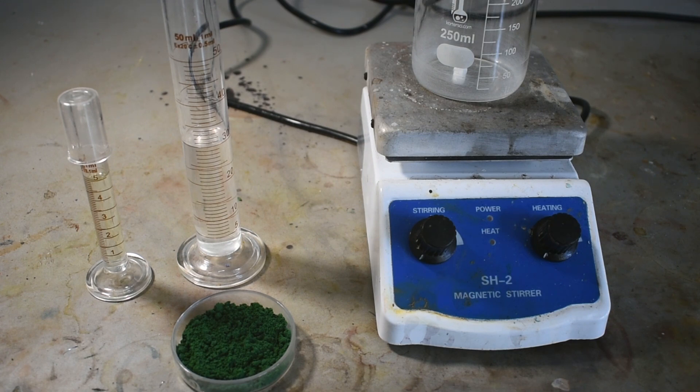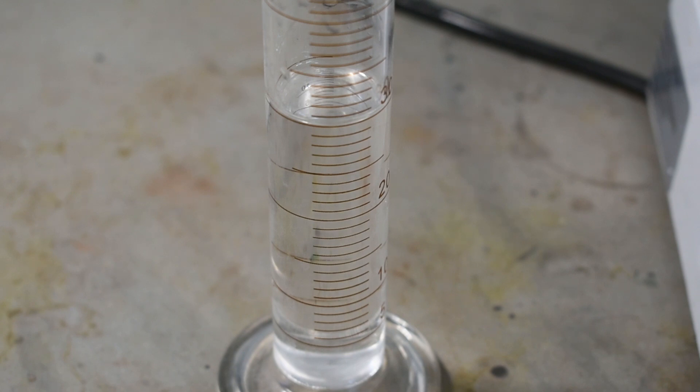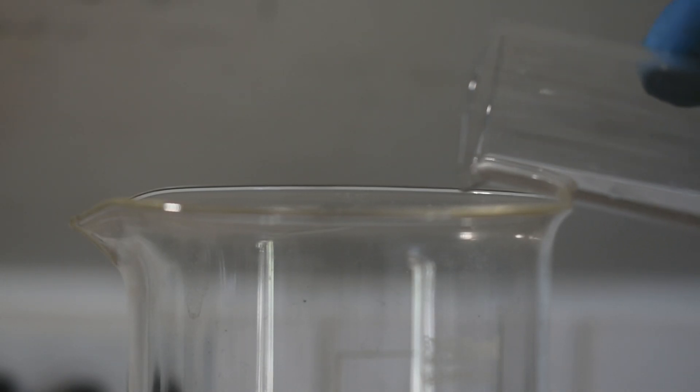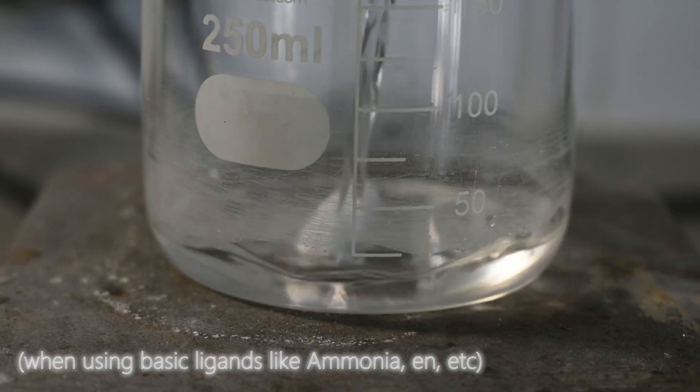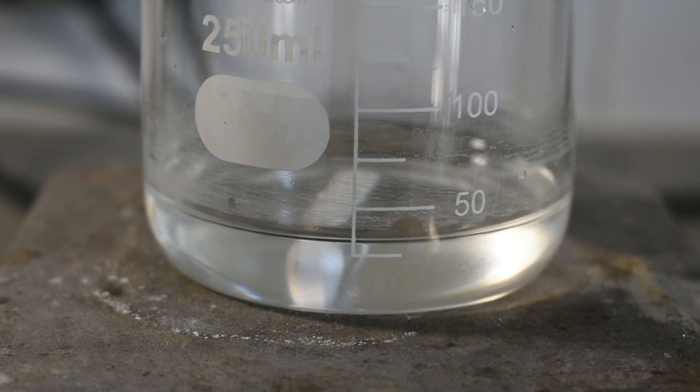We're going to start out with 30 milliliters of dimethylformamide as the solvent for the reaction, and honestly that's kind of odd. Typically I use aqueous solutions of metal salts and then simply add a ligand. However, when making chromium(III) complexes you can't really use water — if you do, you end up with a chromium hydroxide sludge and barely any complex. Using dimethylformamide essentially removes water from the reaction, which will prevent any sludge from forming.